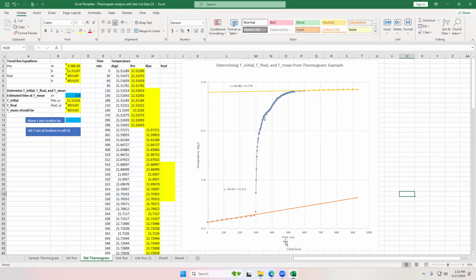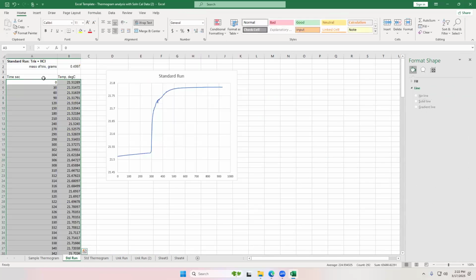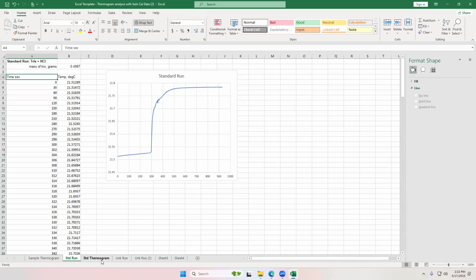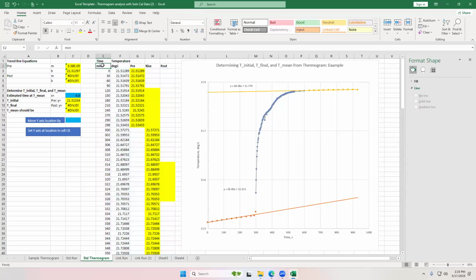And this is really not minutes. I think this should be seconds. Yeah, this should be seconds. If you look at the data, this is time in seconds. So, we take out that 298 data point? And this is seconds. The 298, yeah, that doesn't look nice, huh? So yeah, take out the 298 right there. Good observation right there.